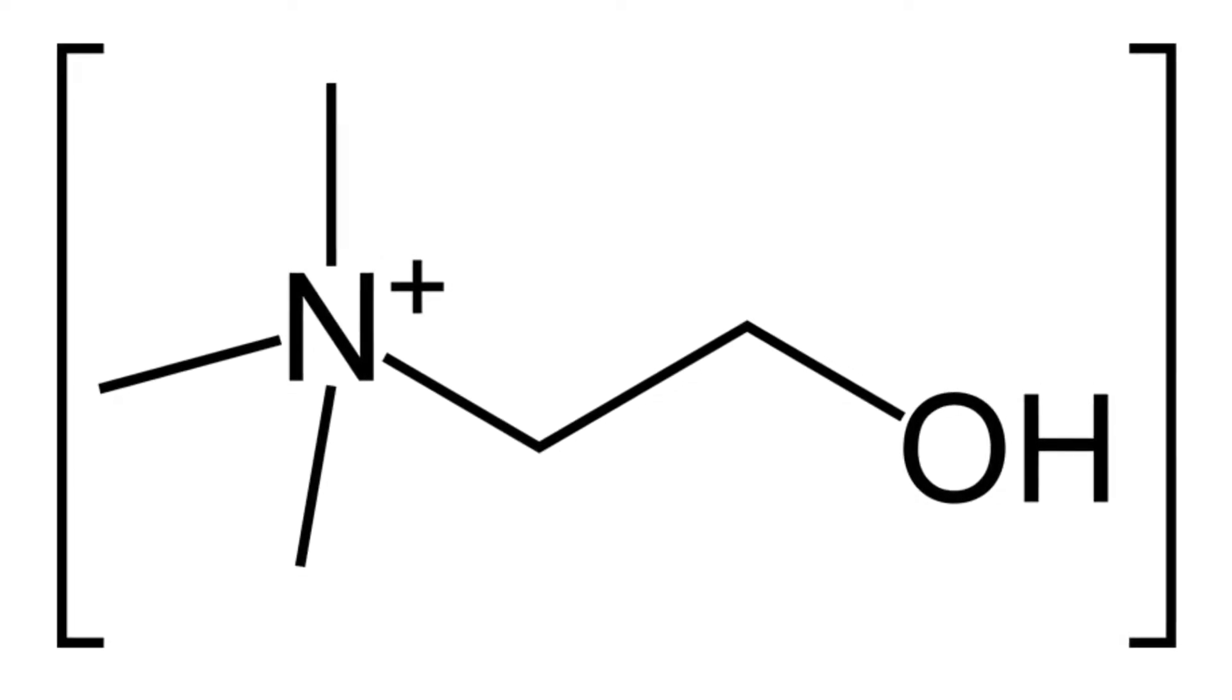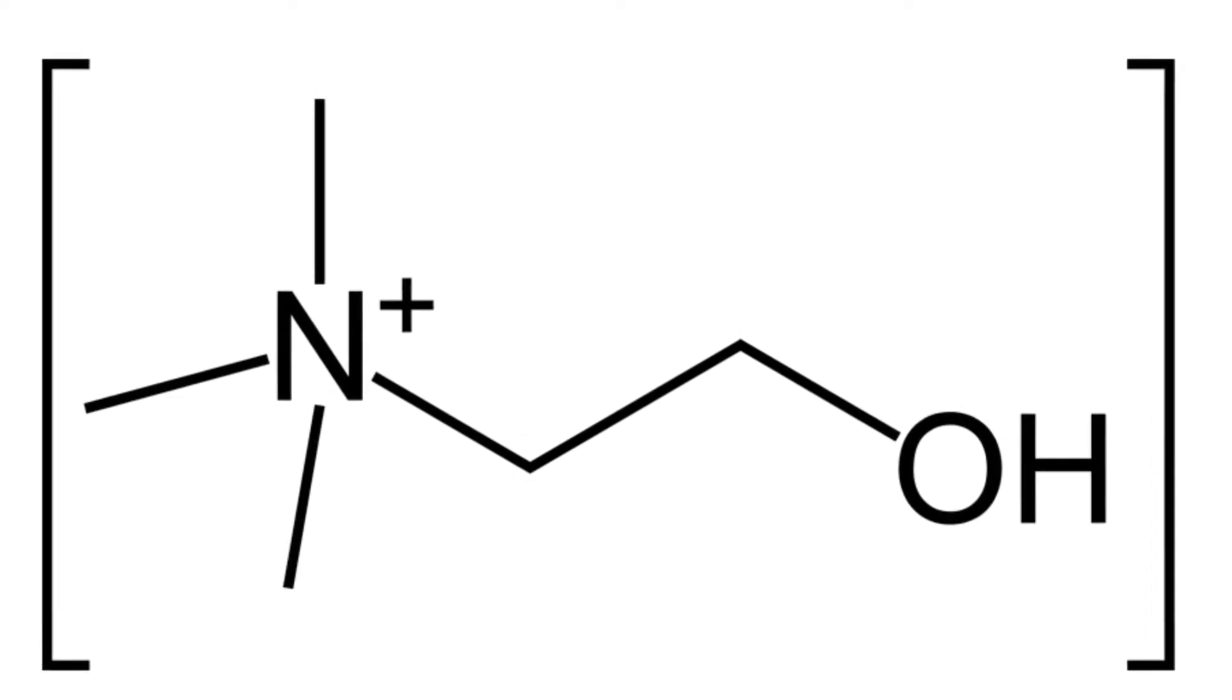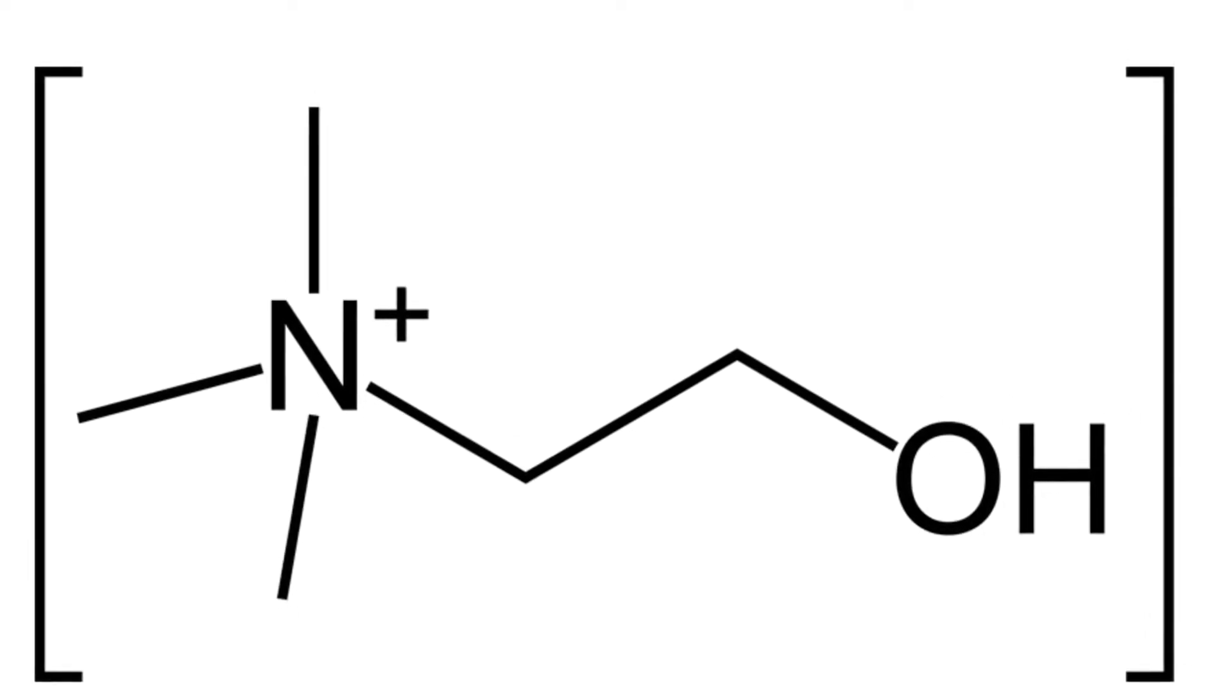Hello everyone, and welcome back to the lab. In this video, I'll be preparing choline chloride by the reaction of choline bitartrate and potassium chloride.